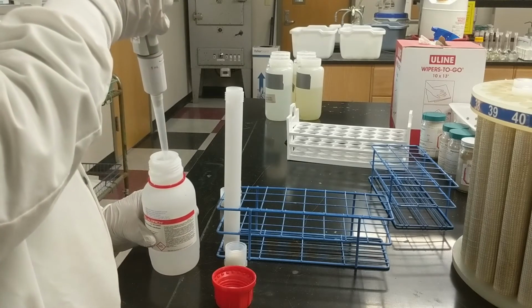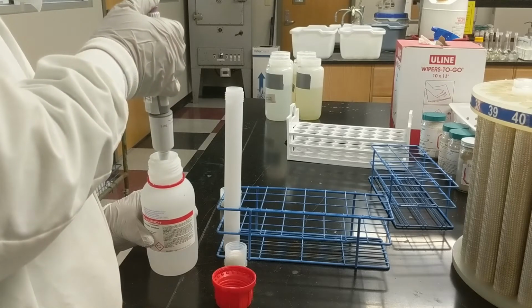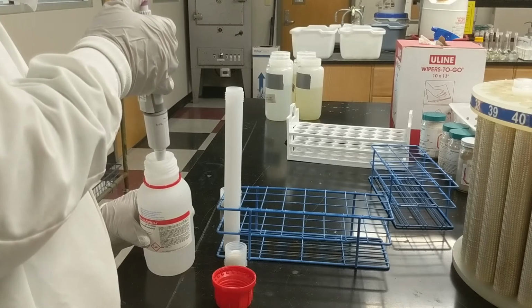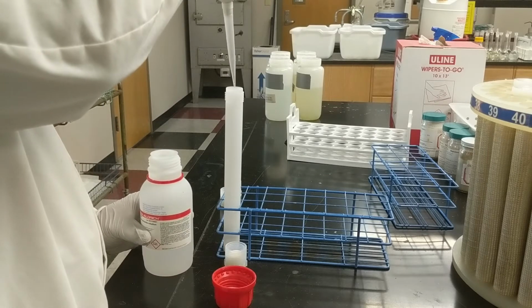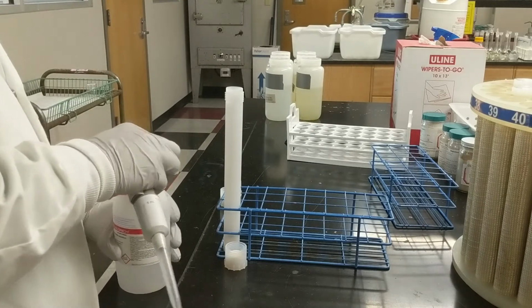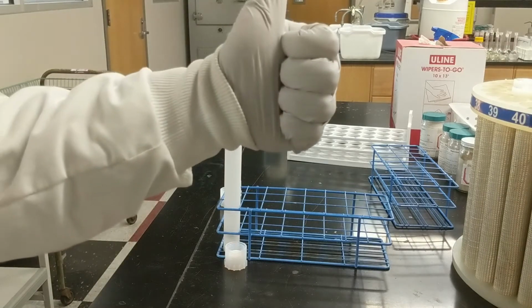This one I weighed directly into the tube, and so I didn't have to wash any boat into it. You can see I've got now 2 milliliters of 30% hydrogen peroxide solution, and that just gets added directly into the tube.